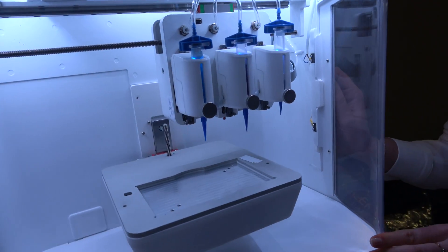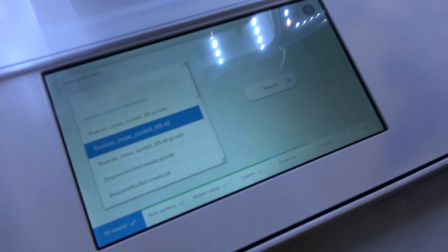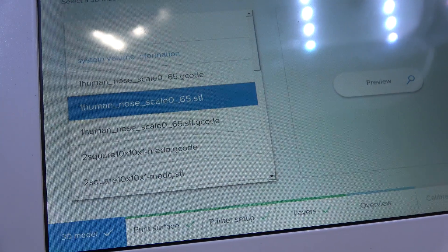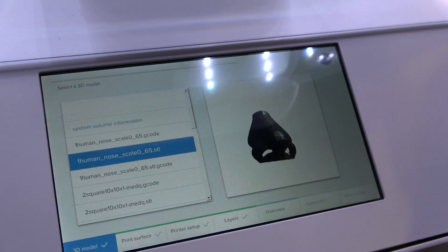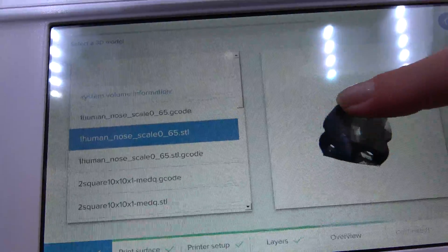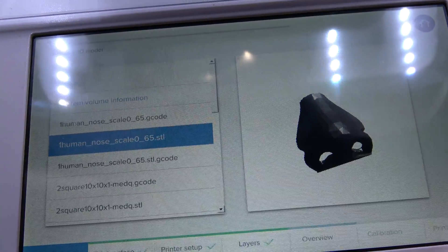With the software you will choose a 3D structure that you would like to print. For example, if you want to print a small nose, you can have a look at the 3D structure that you want to print and see that you've chosen the right one. You can rotate it and confirm this is the one you want to print.